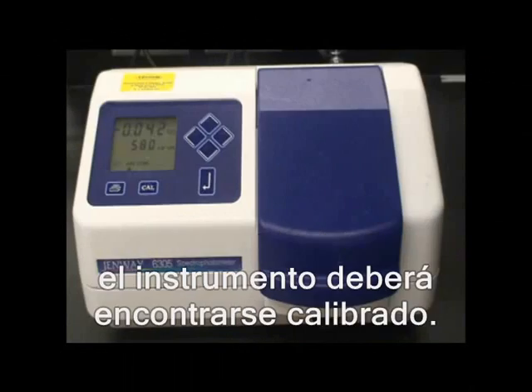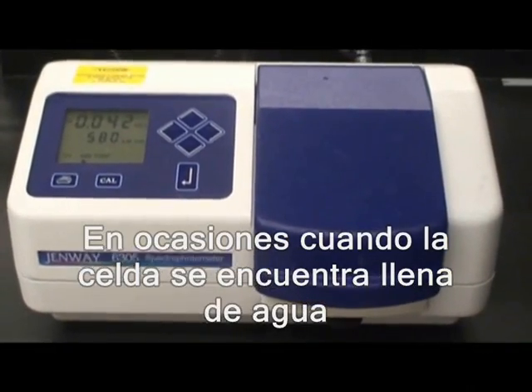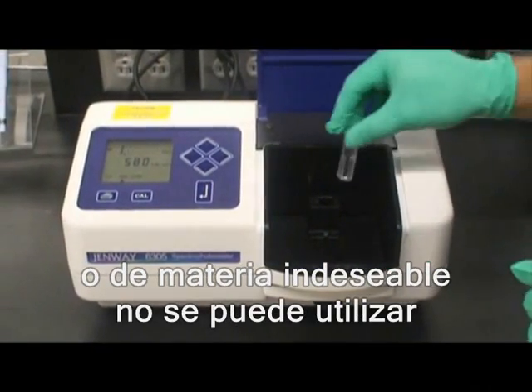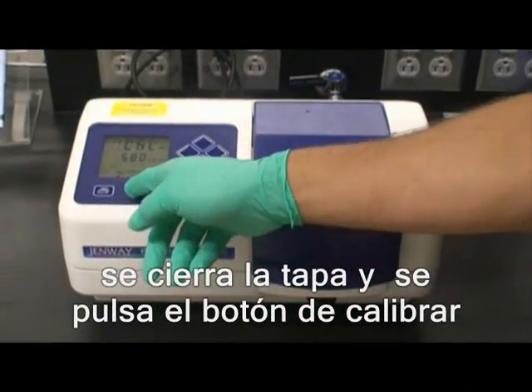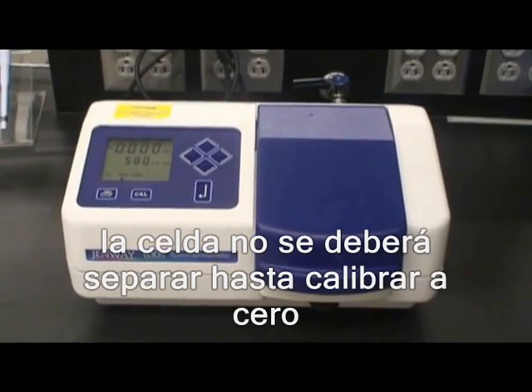Prior to taking sample readings, the spectrophotometer must be calibrated. In some cases, a cuvette filled with sterile water, or a blank cuvette, can be used. After placing the cuvette in the holder, close the lid and press the calibrate button. Do not remove the cuvette until the absorption reads zero.